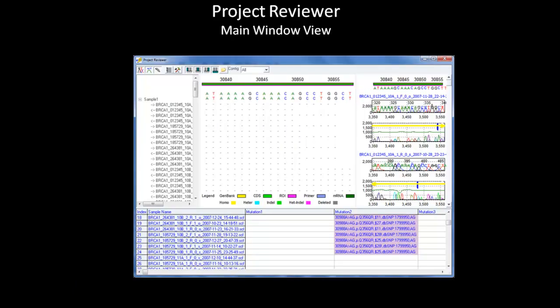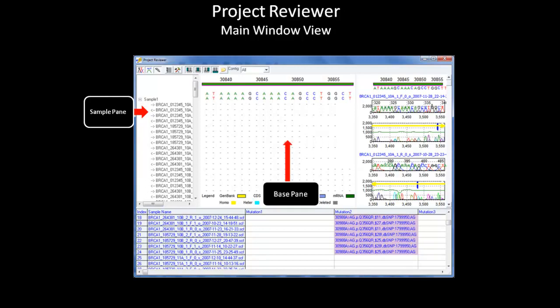The main window of the project reviewer has four different panes. The left pane is the sample pane, which contains all the sample files that were added, similar to the browser pane in the main analysis window. However, the sample pane does not contain contig information. The base pane shows overlapping amplicons according to contig, and only shows positions that are different between the sample and reference trace.